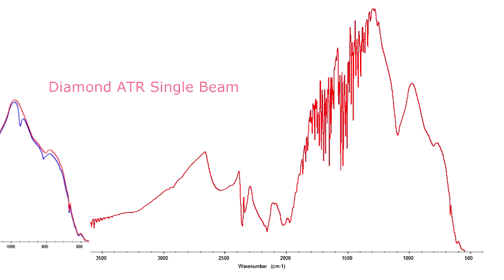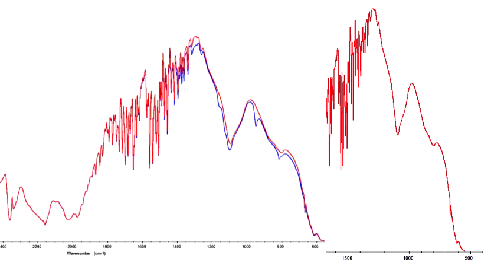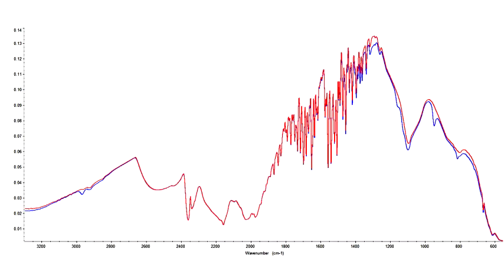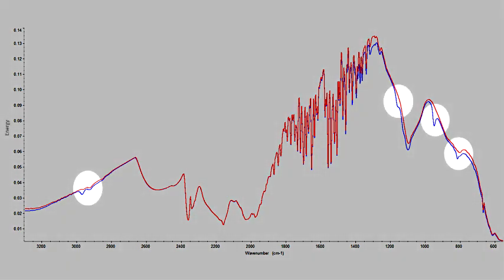The next step is to overlay the background spectrum from the polyethylene spectrum shown initially with inverted bands. Clearly, I have a source of contamination.